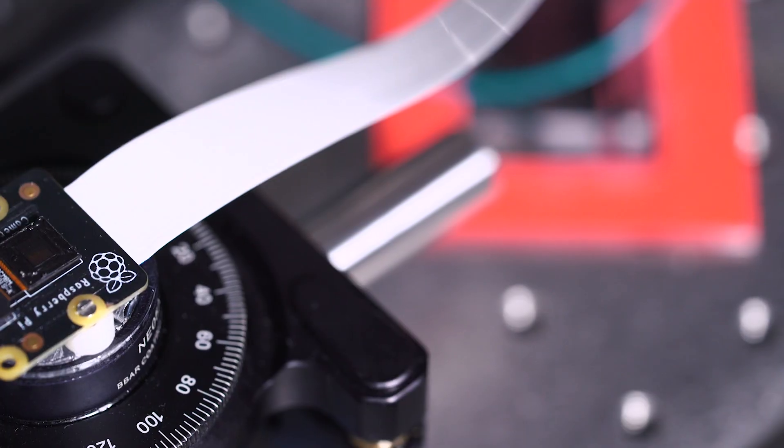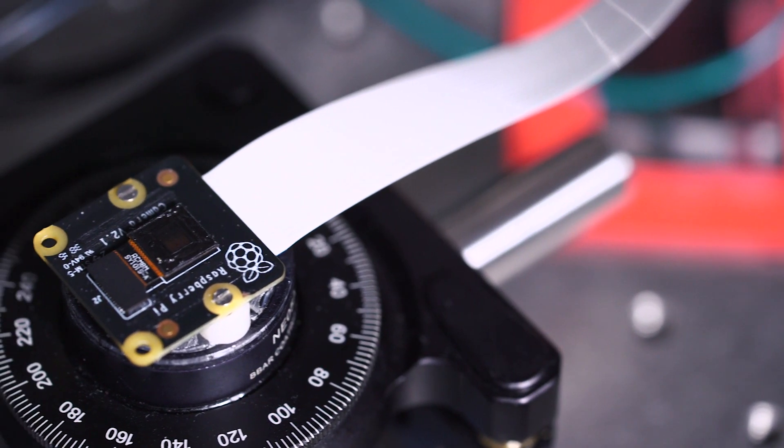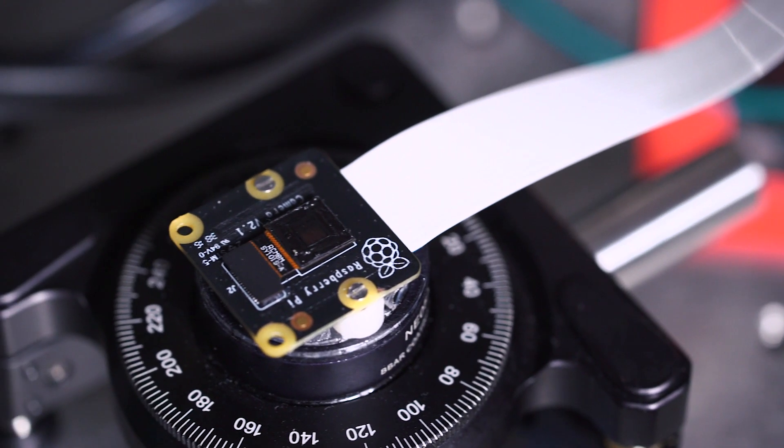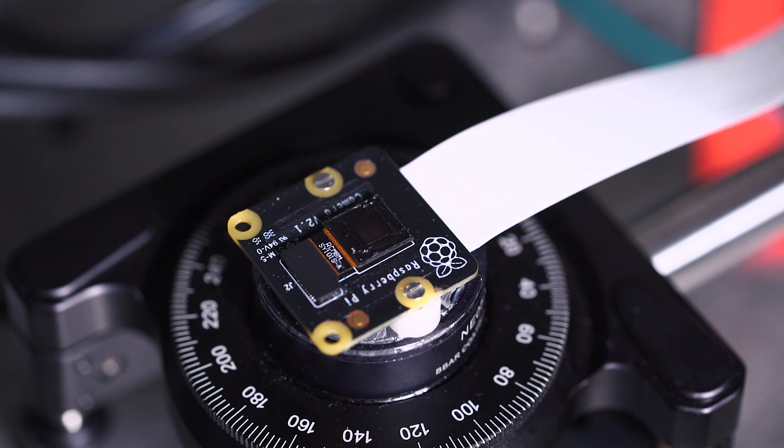We anticipate being able to use this in medical applications. What I think is most exciting about what we've done now is we've taken this idea of taking a three-dimensional camera, shrinking it down to something very tiny, and that gives us some advantages that you would not have if you were using a lensed system.